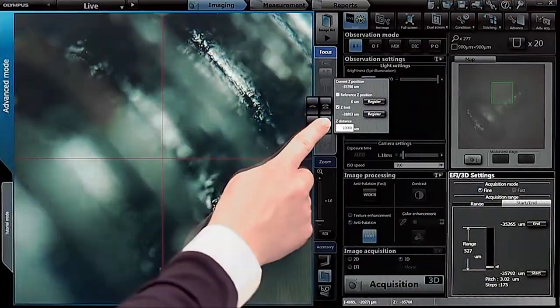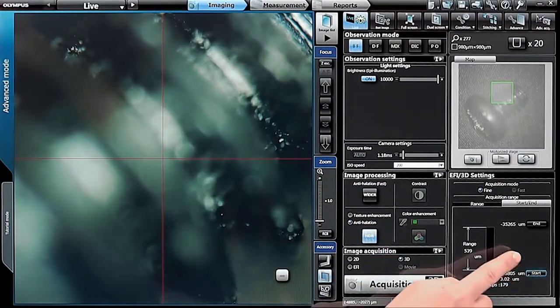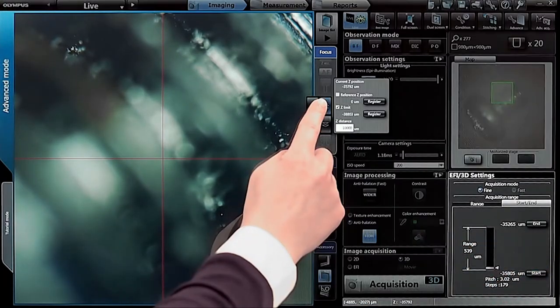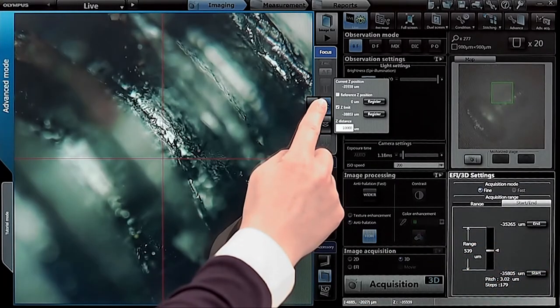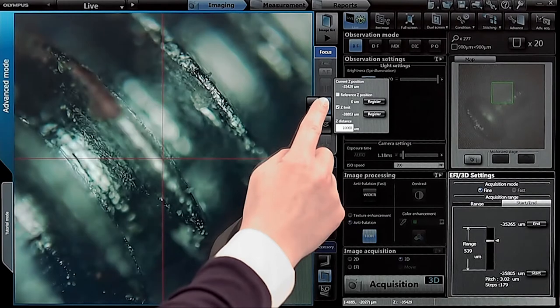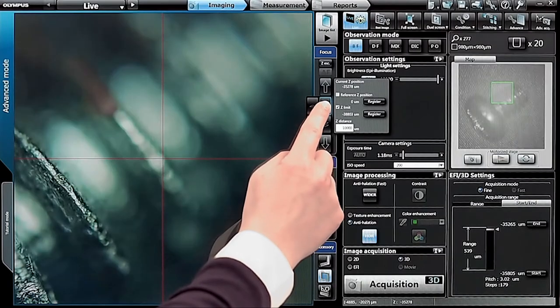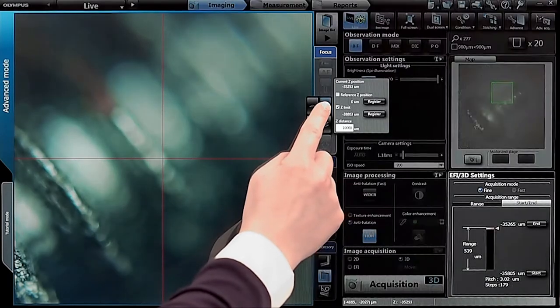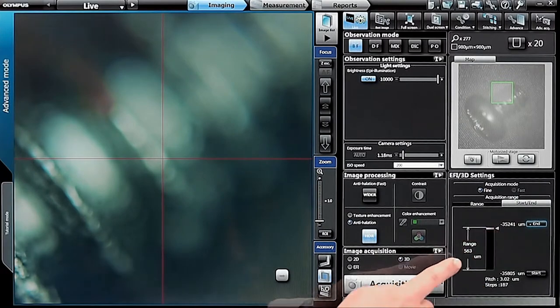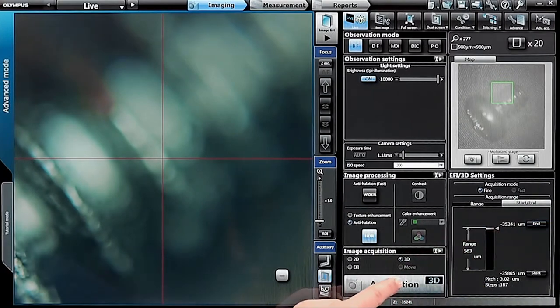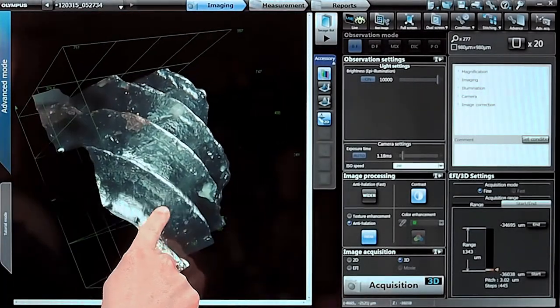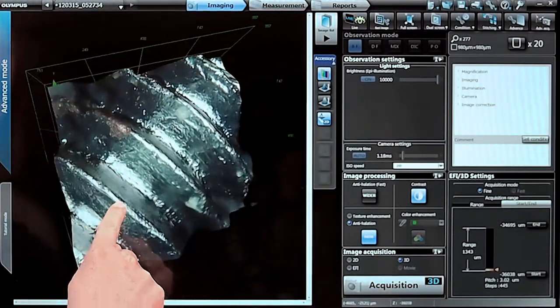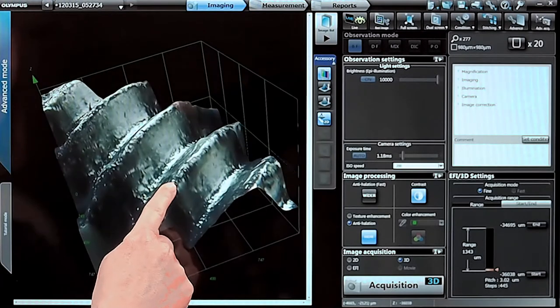For high-level metrology and analysis, DSX microscopes provide precise, repeatable 2D and 3D measurements. You can handle profiles, volumes, height and caliper measurements, and a host of other advanced metrology functions even on uneven surfaces.